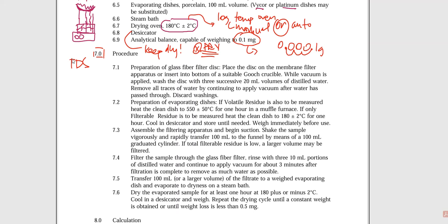All right. So what this means is that I'm going to get a filter paper, and this filter paper could actually be contaminated. Oh no, contaminated, dirty, filthy, trashy paper. Yeah, that's right. So the purpose of 7.1 is to use some water in order to rinse the paper off. So we're going to rinse the paper off to make sure that all of that residue is gone. And it tells me we're going to do multiple portions of 20 milliliters.